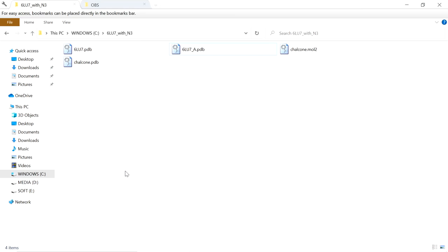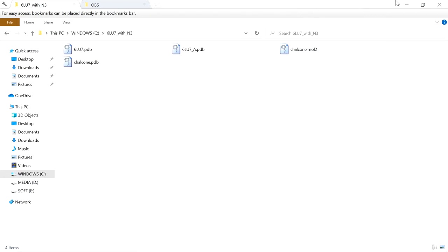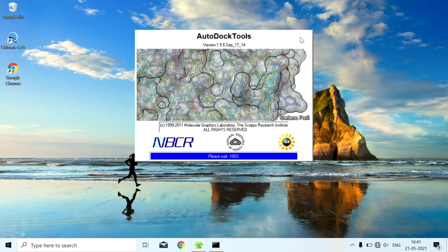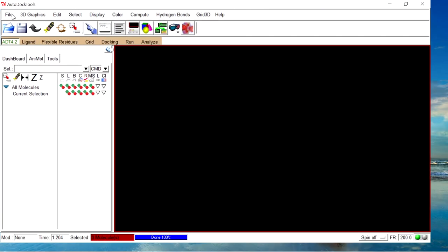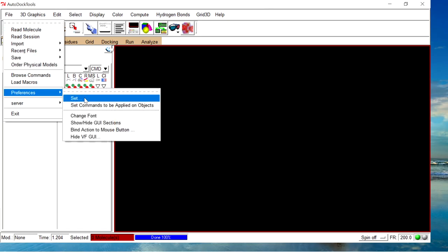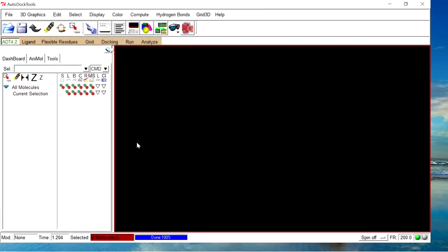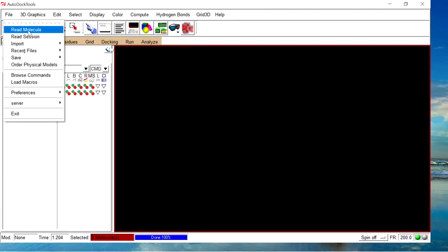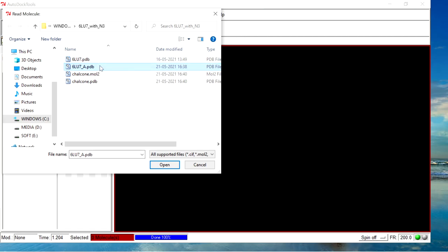Now we are going to open AutoDock Tools. Go to File, Preferences, and set the startup directory. Next, go to Read Molecule File and click on the protein file. This protein file has only the amino acid residues — it does not have the ligand, cofactors, or water molecules. Open this file.